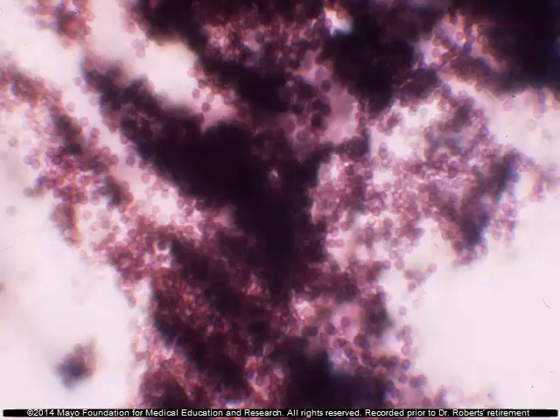This is an example of where you might end up taking a Scotch tape prep from the wrong place. Many times, if you take it from the very center of the colony, that's the oldest part of the culture, and that's where it sporulates the most heavily. In this case, this is what happened. You see all these spores in here, and it's difficult to see because there are so many of them. The bottom line is what you need to do to make a good mount is to make them from an area that is in between the outside advancing edge of the culture and the center of the culture growing up. So it's kind of in the middle.